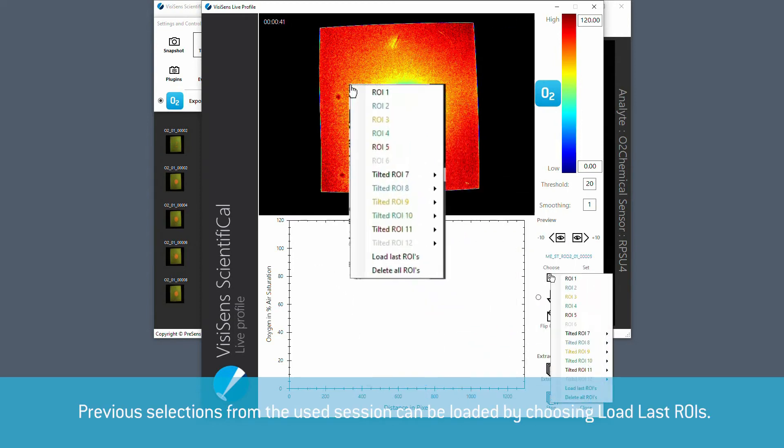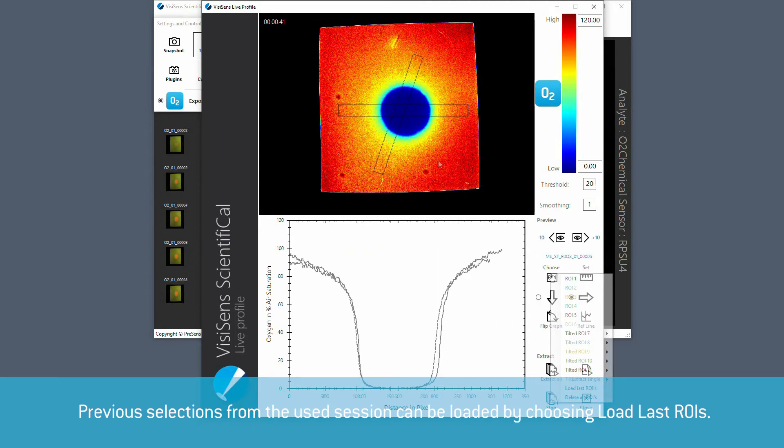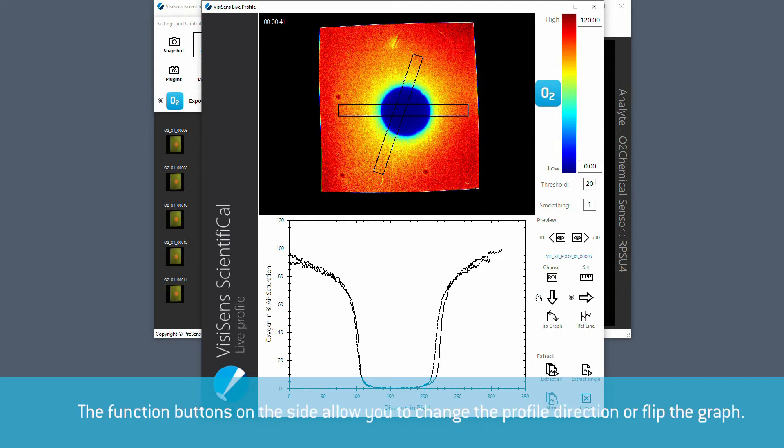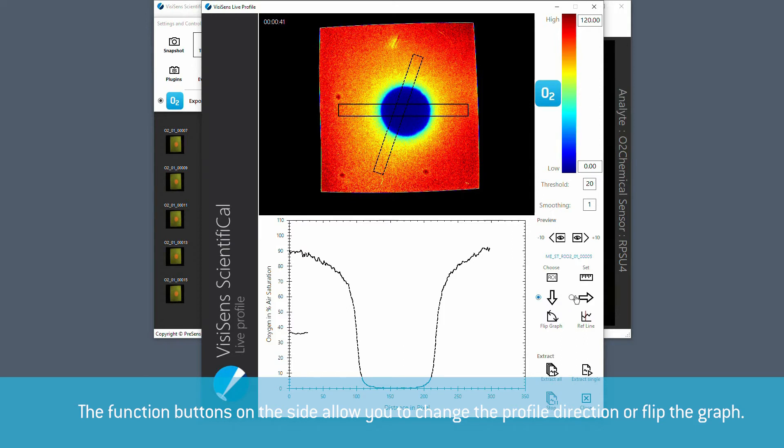Previous selections from the used session can be loaded by choosing load last ROIs. When you have selected a region of interest in an image with the sample, a profile plot will be read out and displayed in the graph below. The function buttons on the side allow you to change the profile direction and flip the graph.